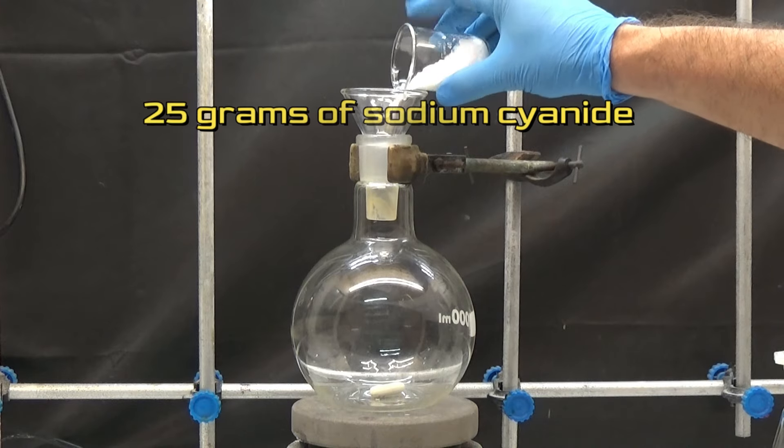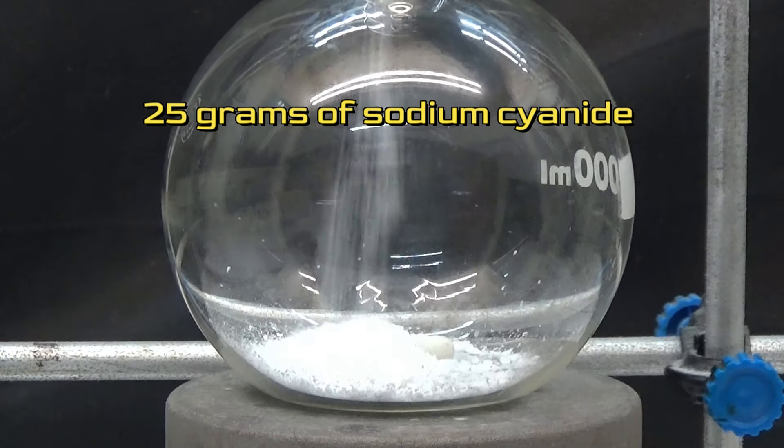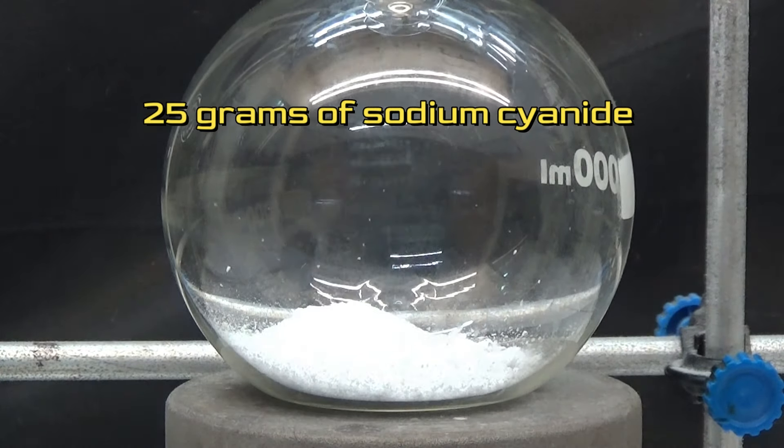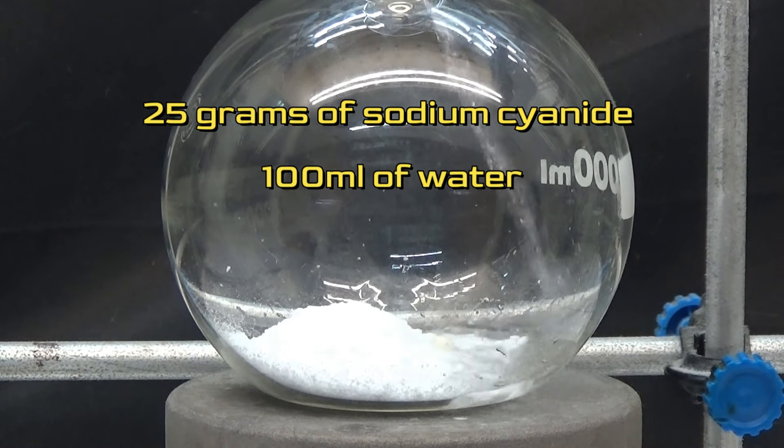To obtain the nitrile, we will put 25 grams of sodium cyanide in a 1000 milliliters flask and dilute it with 100 milliliters of water.